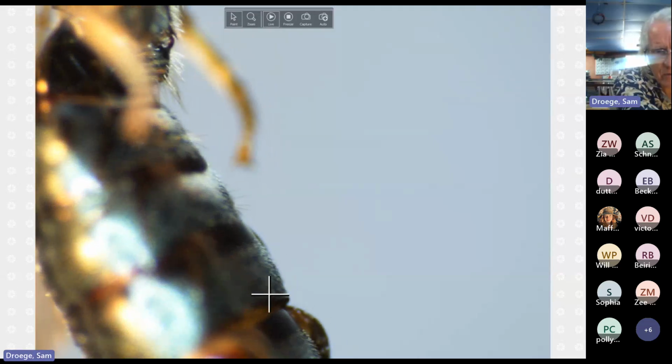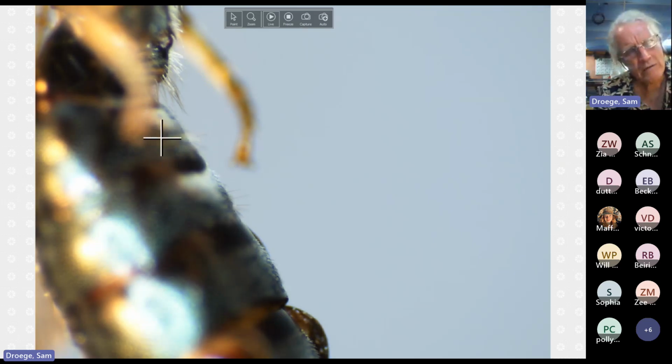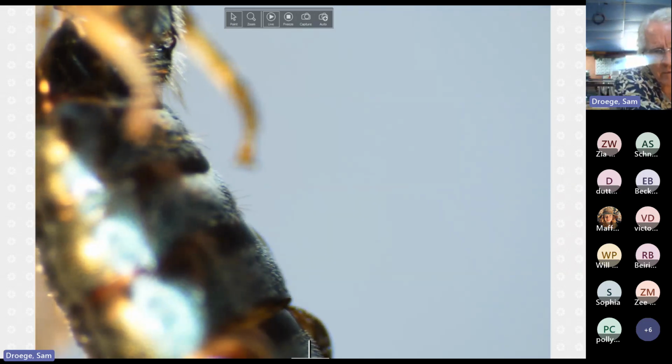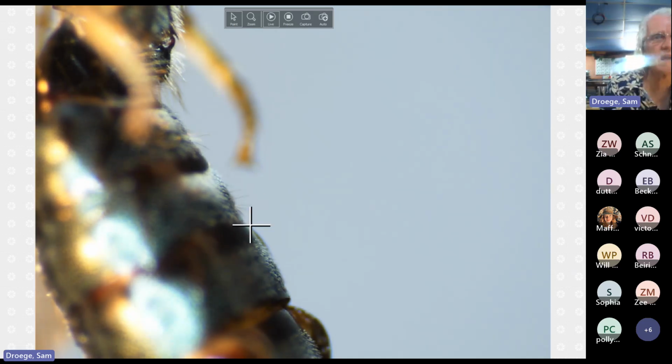And usually, if there are upright hairs on these lower ones, so here's, I believe, S1, S2, S3, S4, is where you're looking for these things. There's very few, maybe fewer than 10 that are upright like this. See those vaguely vague hairs.